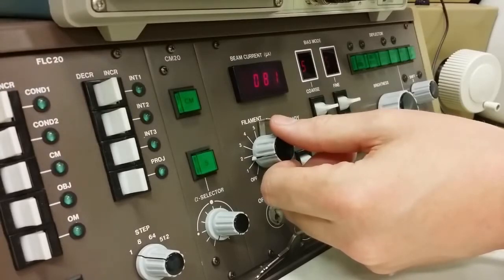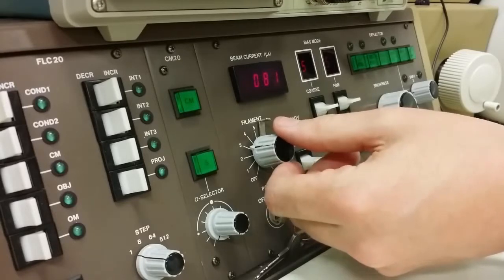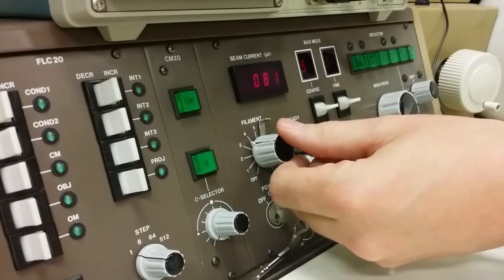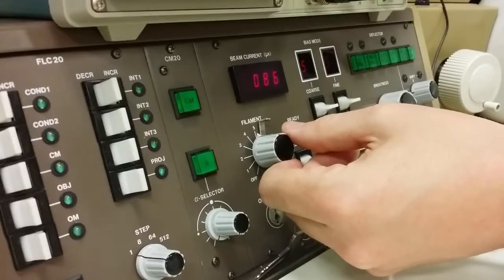The next thing is to turn on the filament. We do that by turning on the filament knob. And here it is important depending on what kind of source you have for the electron. If it is a basic tungsten filament, then you can turn this knob up all the way with a constant slow motion, half a minute turning. If instead you have a LaB6 crystal filament unit, then you must heat that much more slowly, several minutes. Otherwise, if you heat it up too fast, the crystal might crack in its soldering against the filament wire.